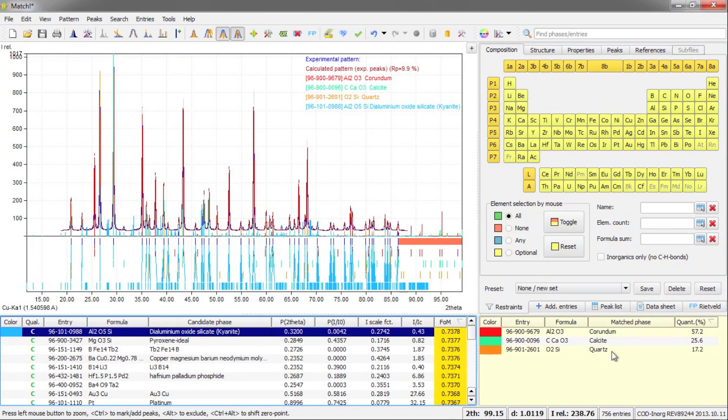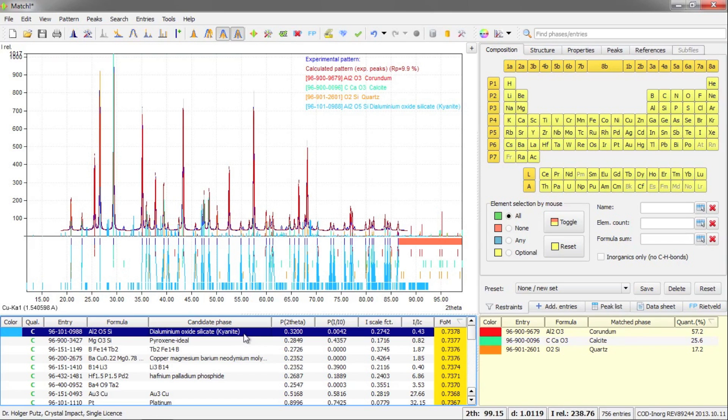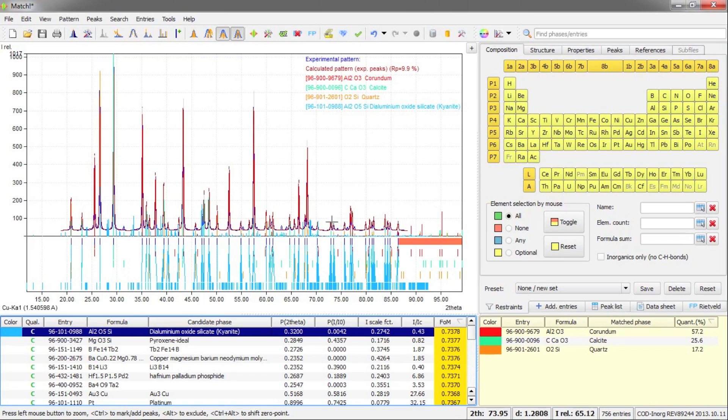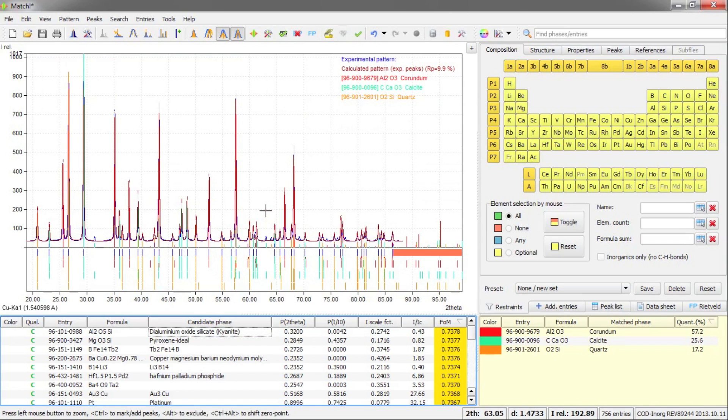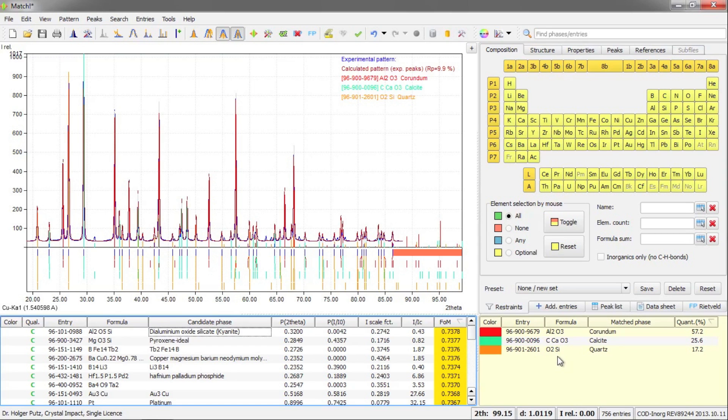We have the quartz phase here on the right hand side. And now you can see the next phase that has been selected automatically does not really correspond to your diffraction data. So I would press the escape key on the keyboard to get rid of this. I guess that's all for now.